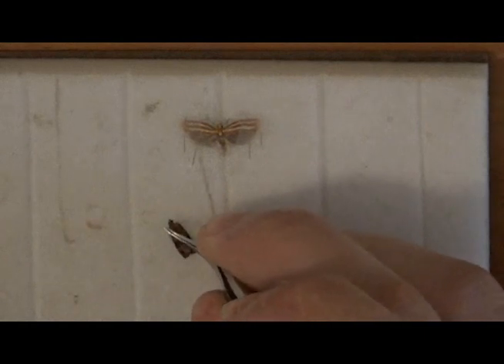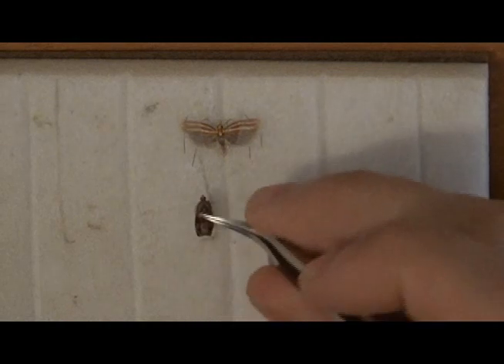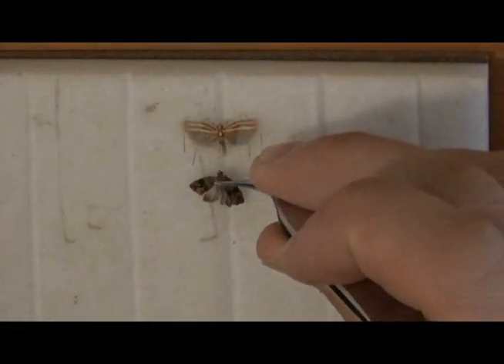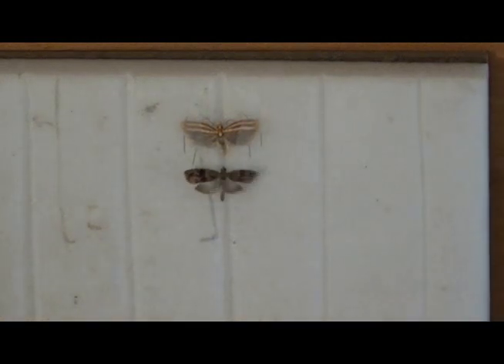If the moth is relaxed enough, a gentle puff of air should be enough to pop the wings out — that's a sure sign that the moth is ready to spread. Trying to spread unrelaxed micro moths will only result in torn wings and frustration. I put the moth in one of the pre-cut grooves and give another puff of air to get the wings spread out even more.